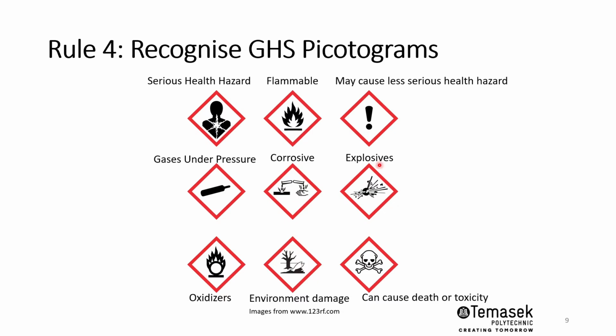While working in the microbiology lab, it's important that you recognize the GHS pictograms. GHS stands for the Globally Harmonized System. These are hazards which have been harmonized across countries internationally, and these pictograms signify to the user certain hazards that need to be taken note of. This includes pictograms such as this that denote serious health hazards, and pictograms such as this with a flame, meaning that the chemical or reagent may be flammable, and so forth. You will need to know the pictograms and how they relate to the hazards that come with them.